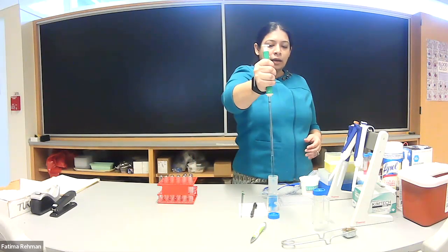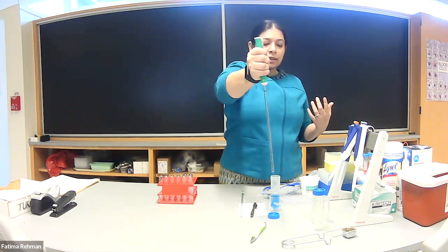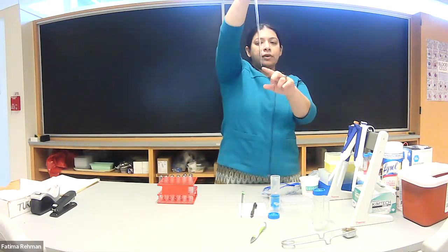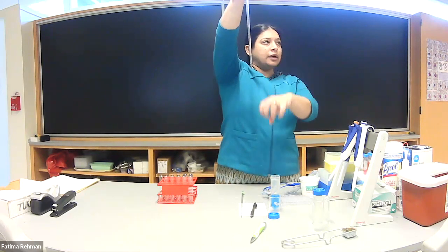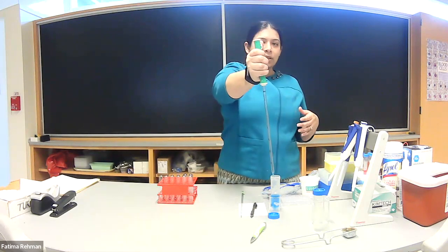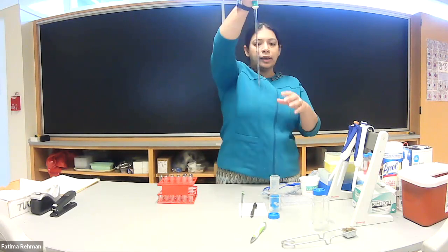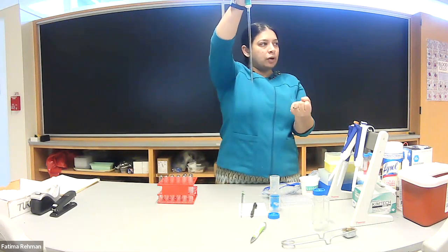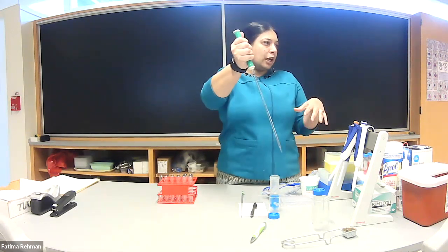If I just release it like that, you'll see some liquid remaining in the bottom — it didn't empty completely. There's a little bit of liquid that stays and links together in there. To empty it out, you can go up and down a few times fairly quickly — wait for all the liquid to collect, then go up and down to push it out.